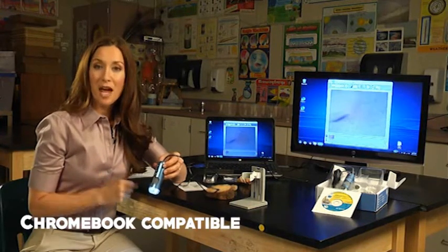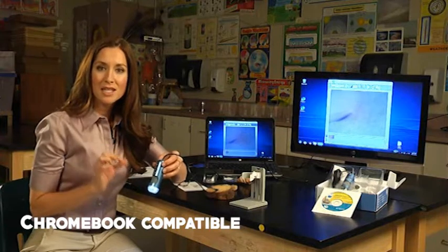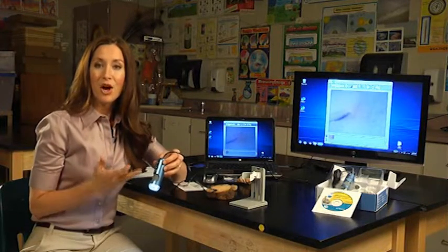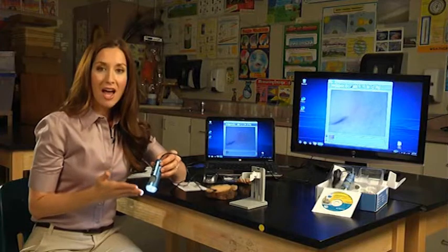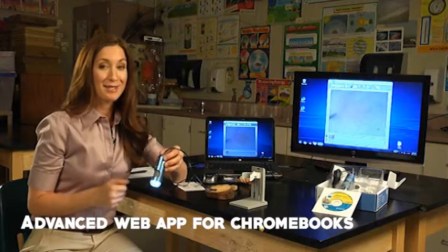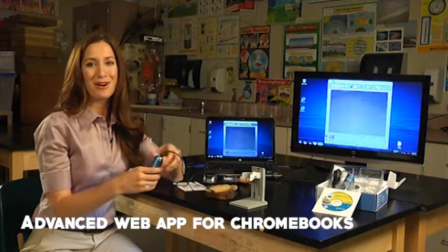This is great after you've captured a photo because it allows you to zoom in and really see the most minute detail. Also, it's great when you're viewing live images because you're going to see an incredibly crisp, clear image. And it's extremely easy to use. Let me show you how it works.